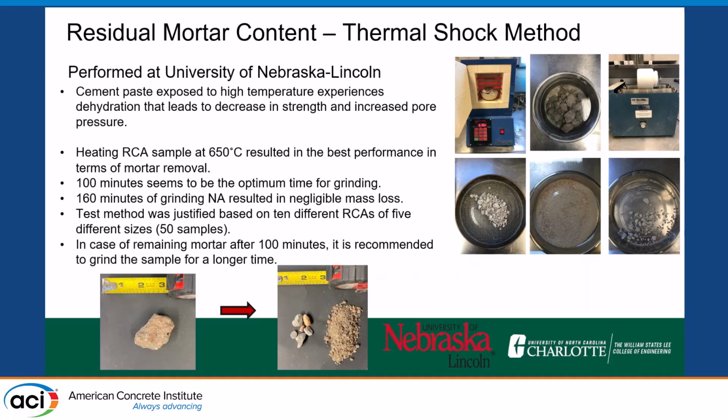The problem was there are people who've done this in the past but haven't necessarily standardized or optimized the procedure for either temperature, time, or other parameters. So this particular method was optimized by University of Nebraska-Lincoln and used as our reference for our work with the XRF. We assumed this was going to be our target values.